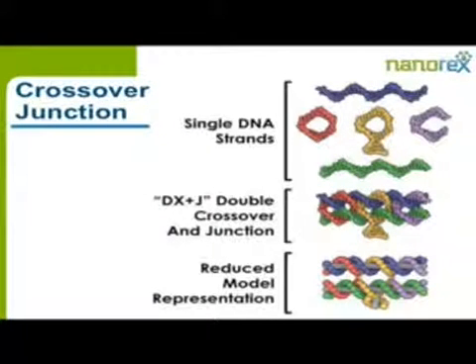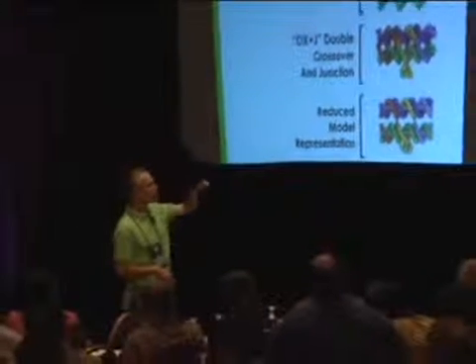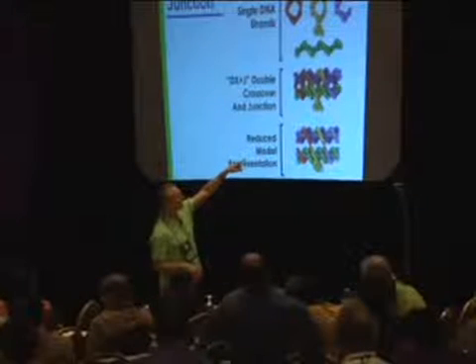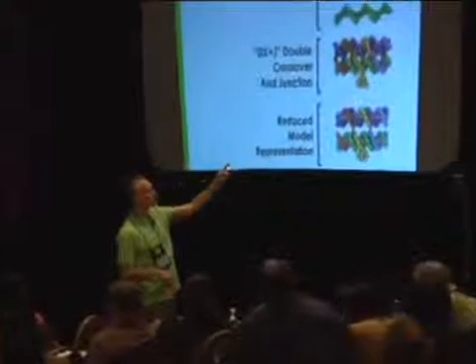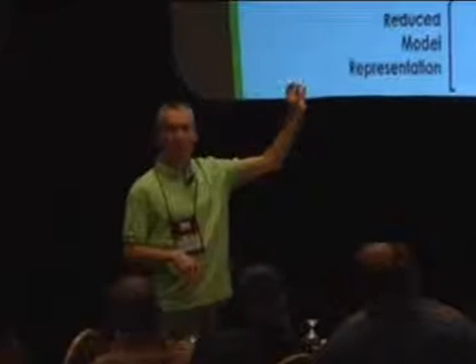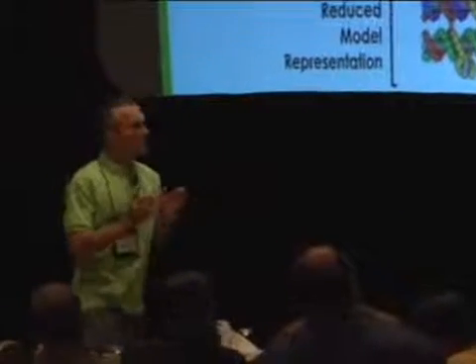This is just another crossover. What's different about this is I've created an exploded view at the very top, showing each individual strand in the double crossover junction molecule. And the junction's this little thing sitting at the bottom, the yellow strand. What's happening there is that the yellow strand goes up into the double crossover and is part of the double crossover, but it also shoots back out, and starts combining with itself. And that's the junction, this little thing here, and that can be extended to be very long. What you have basically is this perpendicular segment of DNA that lies in the plane of the crossover, but is perpendicular. And you can build off that. And so using all these tools, these ways of stitching together DNA and creating crossovers and junctions, you can create very intricate and elaborate frameworks out of this material.